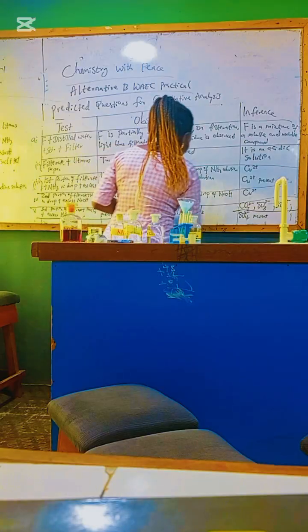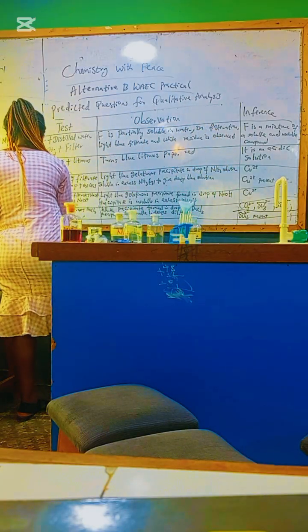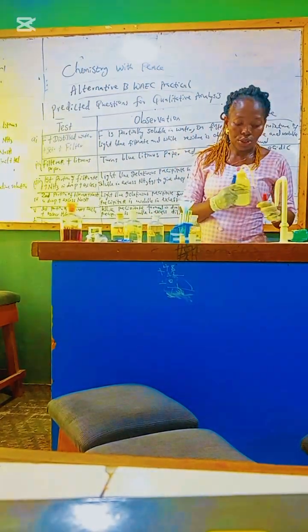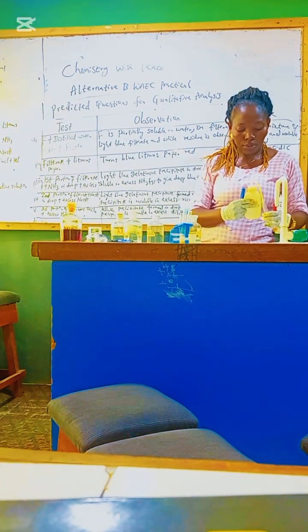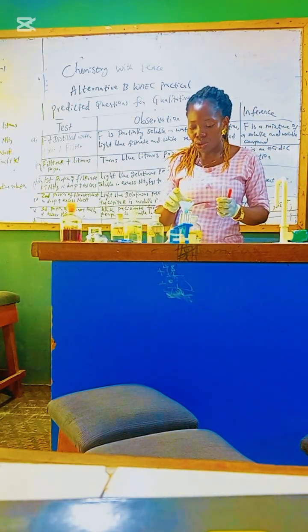Then the last question says the residue plus iodine solution.